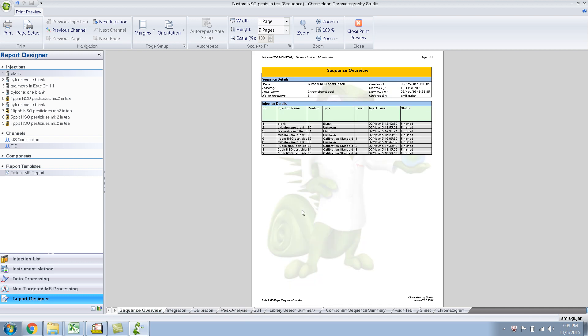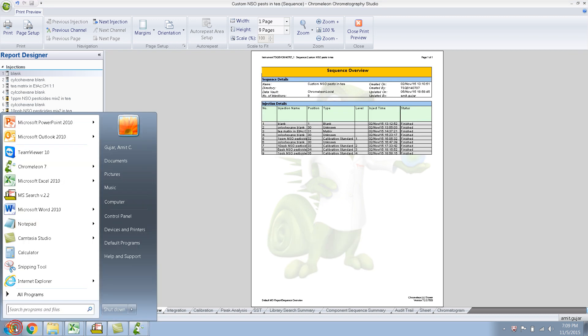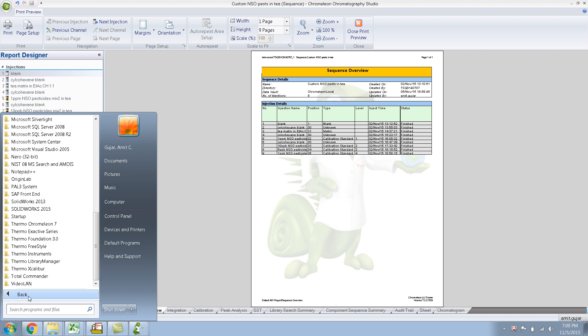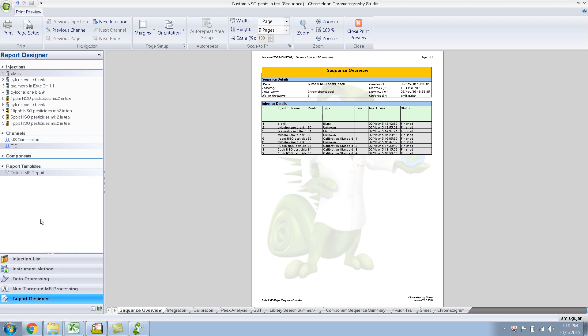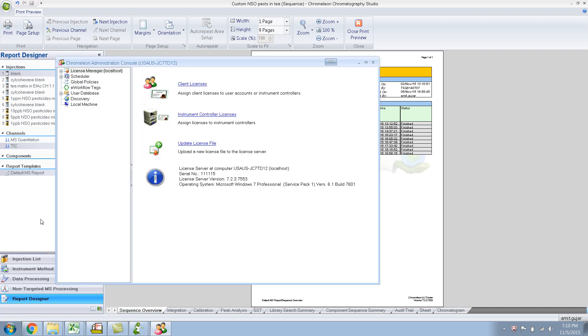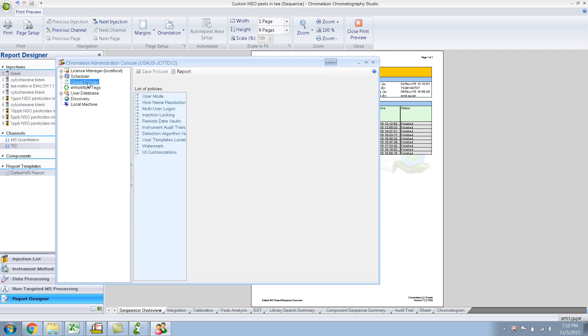The way you do it is you go into Chromalian, the Chromalian folder over here, go to the Administration console. And under Global Policies, there is watermark. And I think by default it's checked. You uncheck it and save the policies.